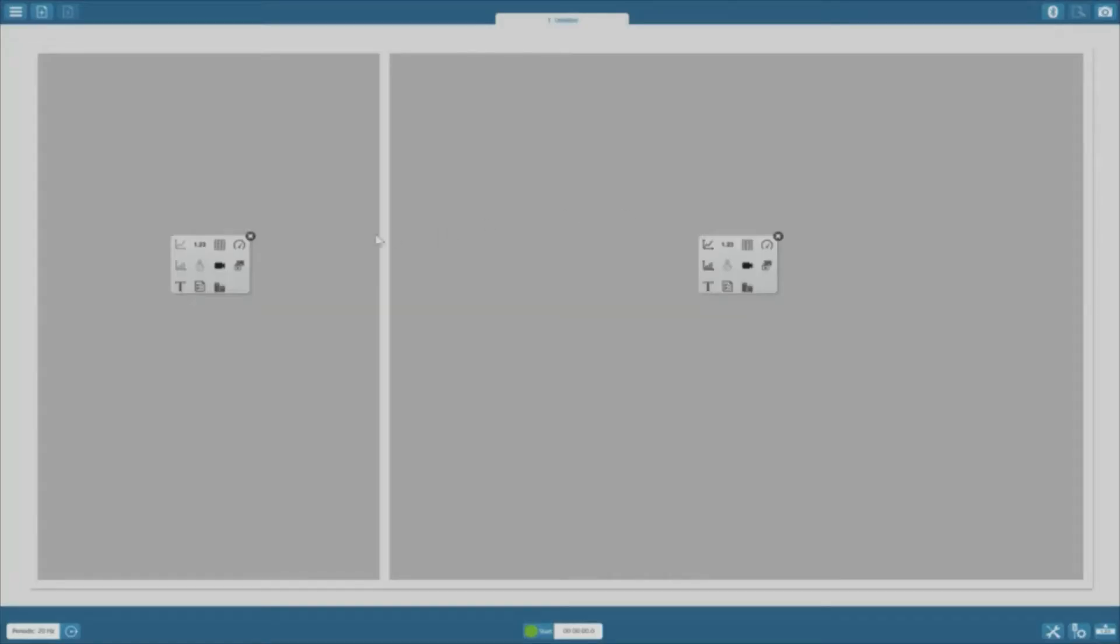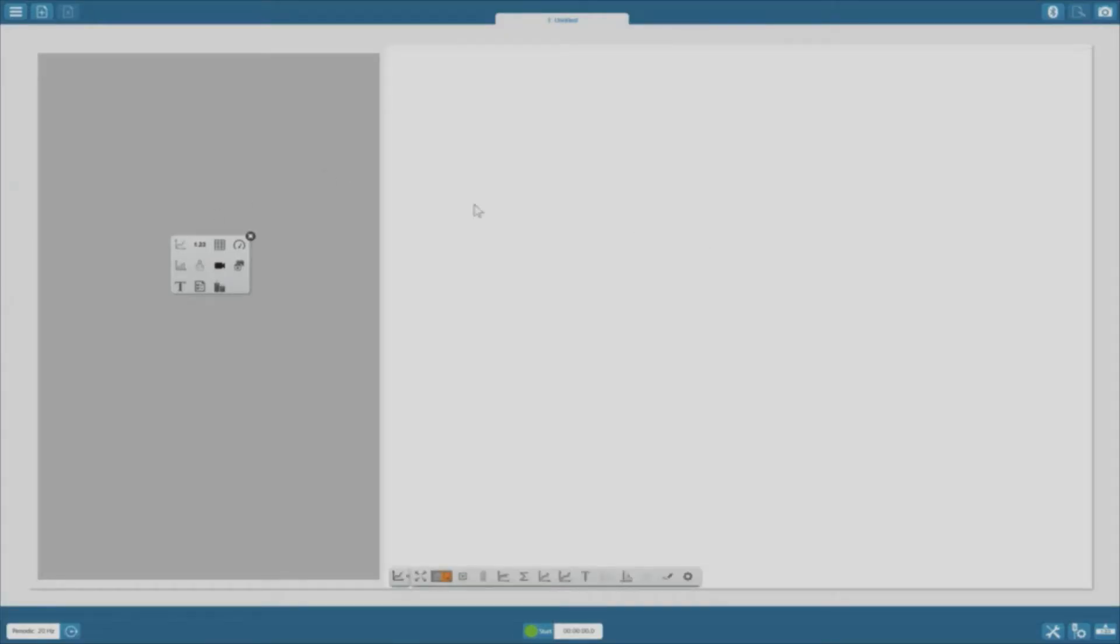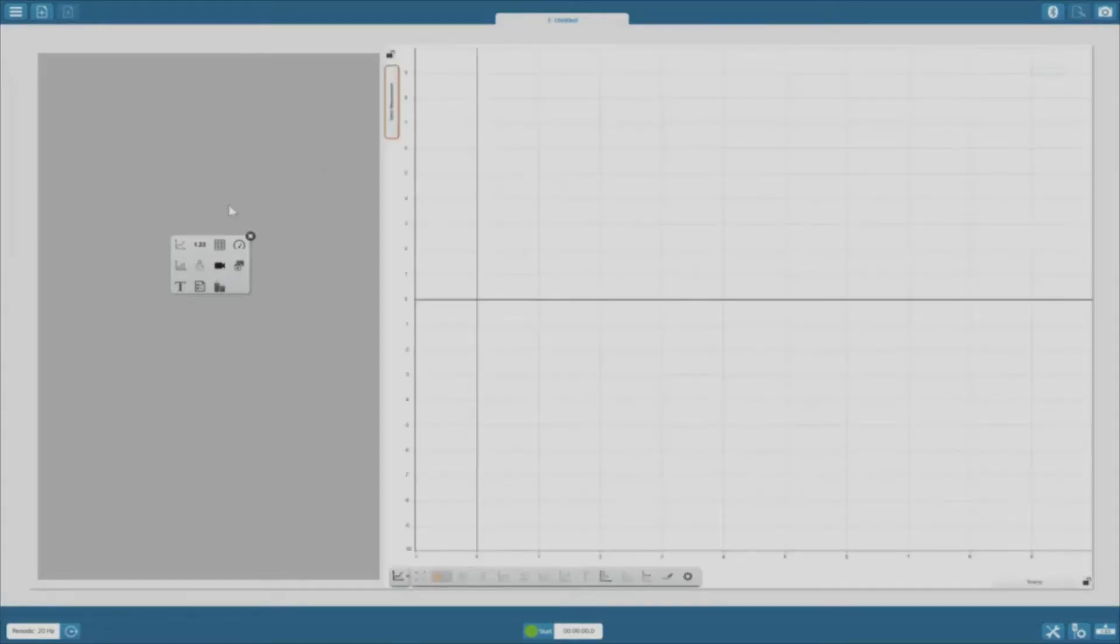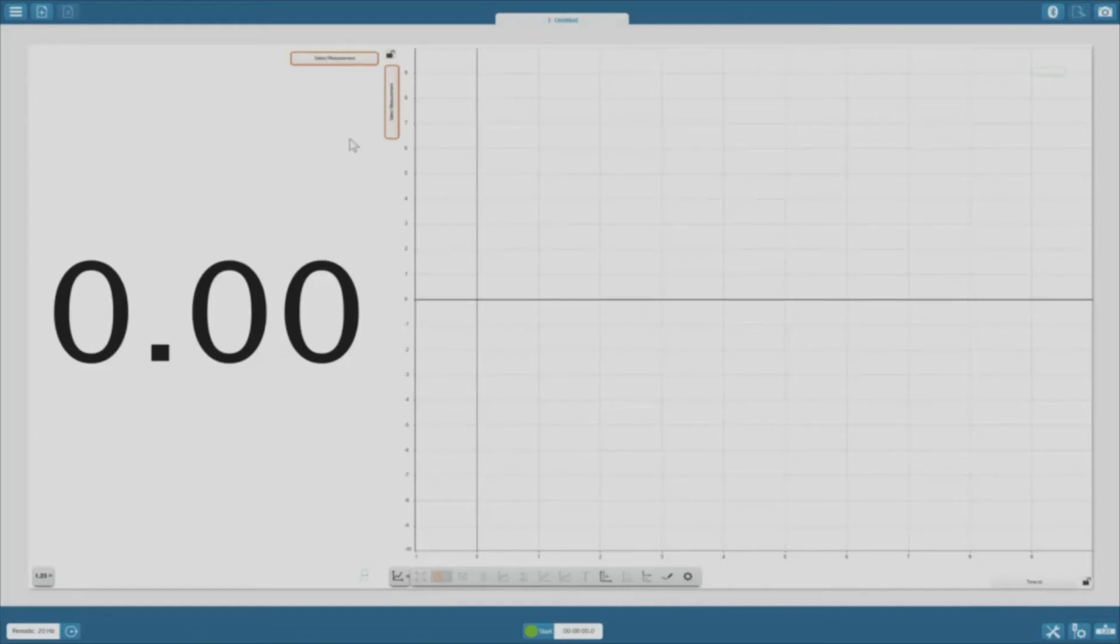The program is now asking us how we want our data displayed in each panel. There are many options, but in this class, we'll just use the first two. The first icon is a graph and it will allow us to graph our data. The second icon is a number 1.23 and it will display a numerical value of our measurements. Now that we can display our data, I'll give you a tutorial on how to use specific buttons in SparkView.